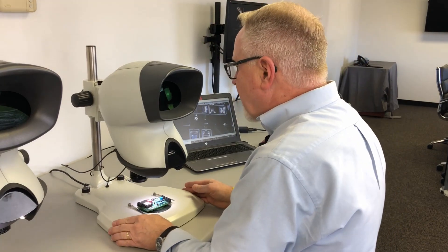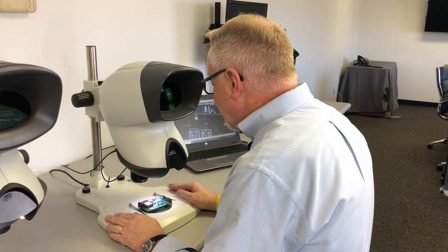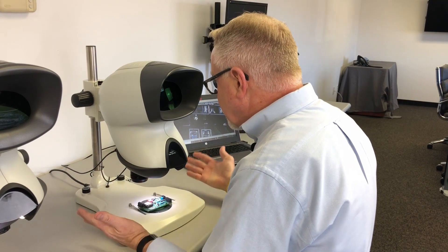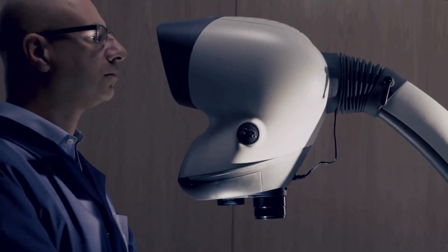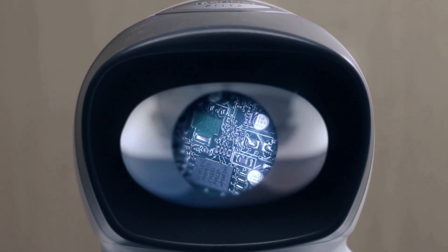With all Vision products, we pride ourselves on ergonomics. You have a stereo image, but you're not married to eyepieces. You sit, look into the head, and have a straight-on stereo image that's exceptionally high resolution and very bright.